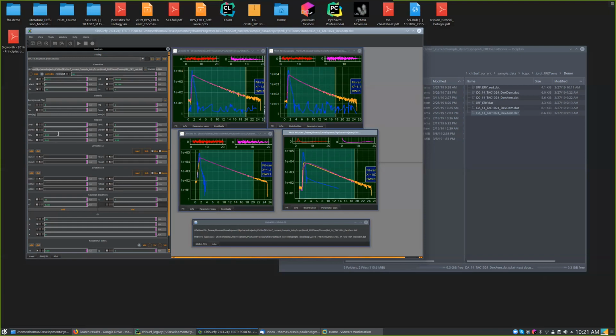Okay, this would be my next question. So these values are now normalized, so these are percentages, right? Internally there's no normalization. You would have to calculate these values based on your spectra. Normalized or non-normalized values doesn't matter, but I would use normalized values. They don't have to sum to 1. Okay, perfect. But I recommend normalizing them, because personally I always work with normalized values, and I haven't tested whether something funky will happen if you put in a very big number. So I would just normalize it to 1.